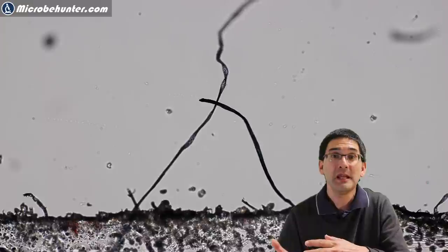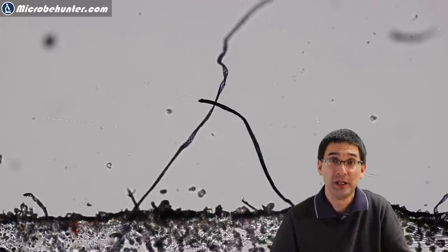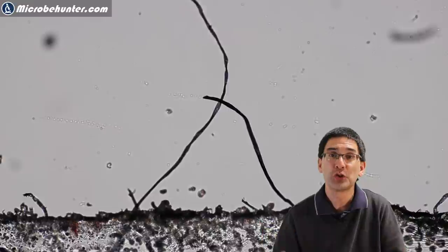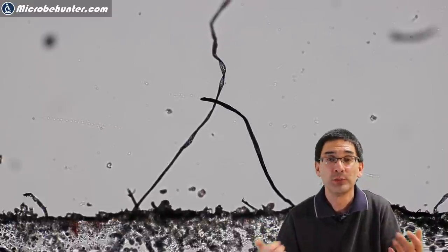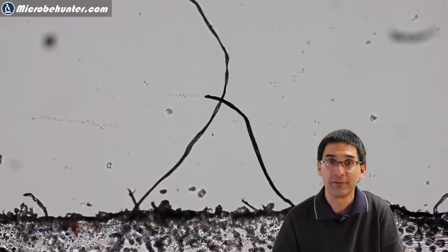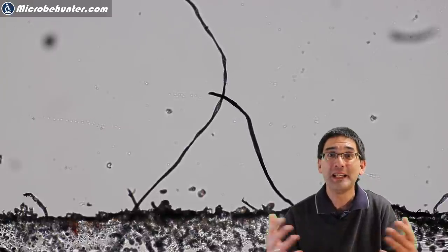It appears to be very natural but in reality it's simply a physical process and of course this movement is not because they are alive so you do not have to worry about any microscopic worms in the face mask.